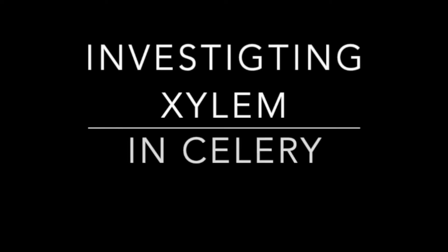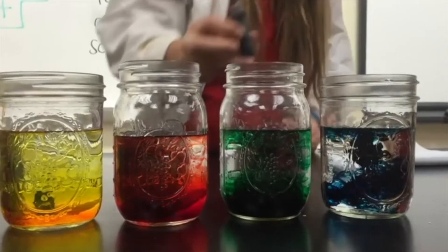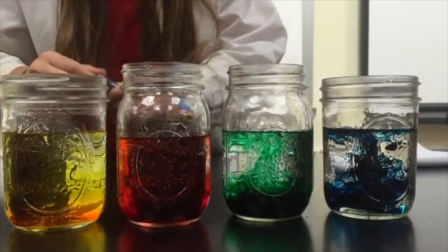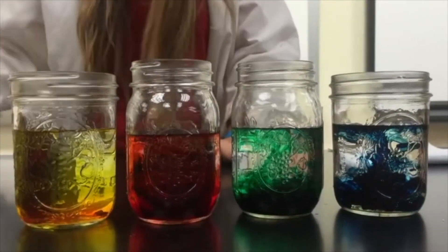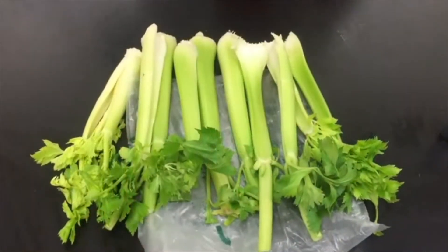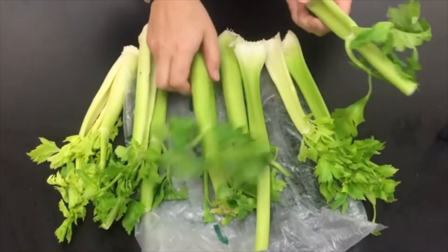This experiment is about investigating the xylem in celery. To do this you need some jars with food coloring mixed with water. The darker the better. And you need some leafy celery stalks.